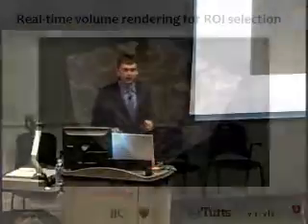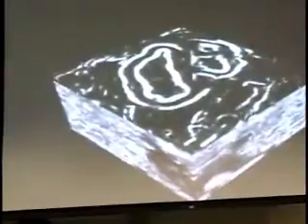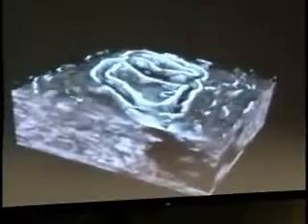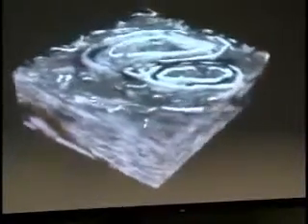So here is a demo of how this pre-visualization would work. Here you can see how the user can quickly move across sections in real time. It also shows on-the-fly edge detection and denoising of the data. And this is one of the data sets that we acquired. It has 1K by 1K pixels by 100 sections. And again, this runs on a Windows machine as long as it has a GPU.